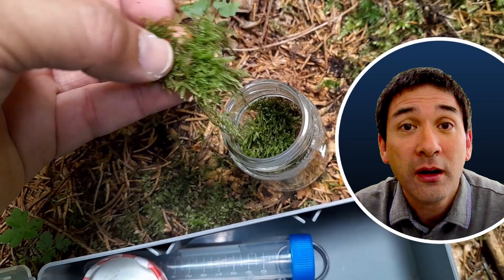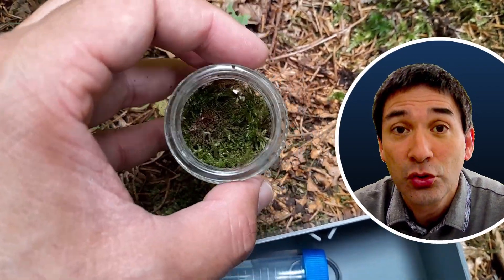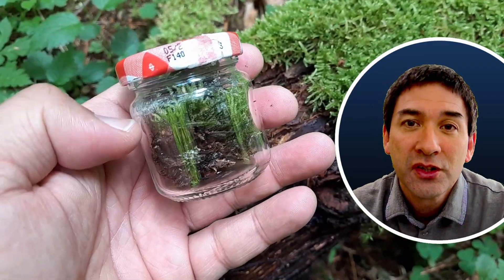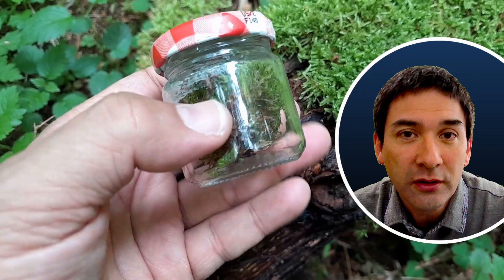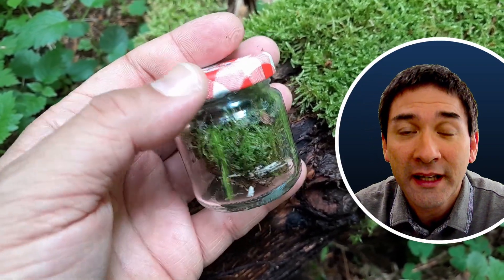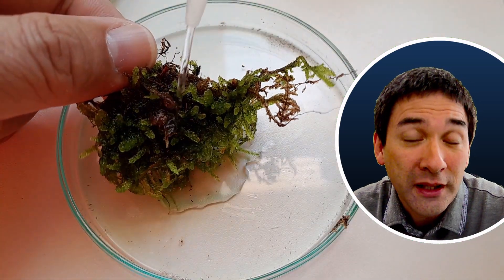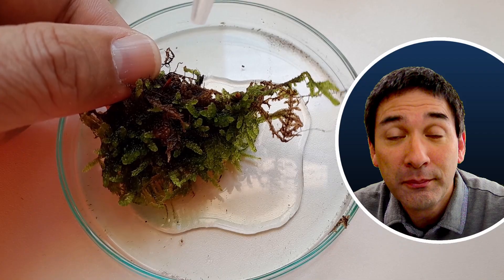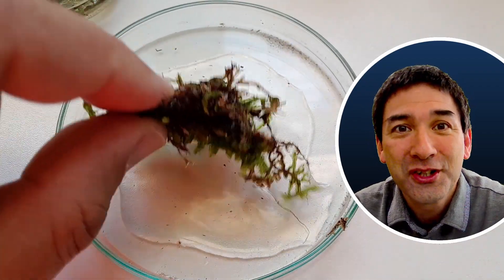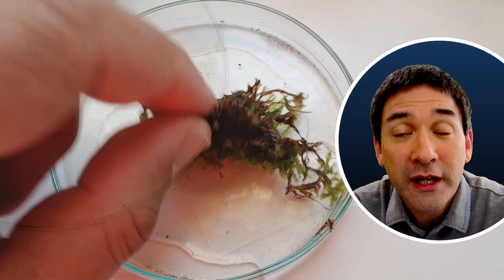Tardigrades, even though they are able to withstand dryness and are very resistant to it, still like to have it a little bit moist. So I took along the container and added a little bit of water to prevent it from completely drying out. Then at home I put it on a petri dish, added some tap water, and tapped the moss in the petri dish, which rinses and flushes out whatever you're able to find in there.